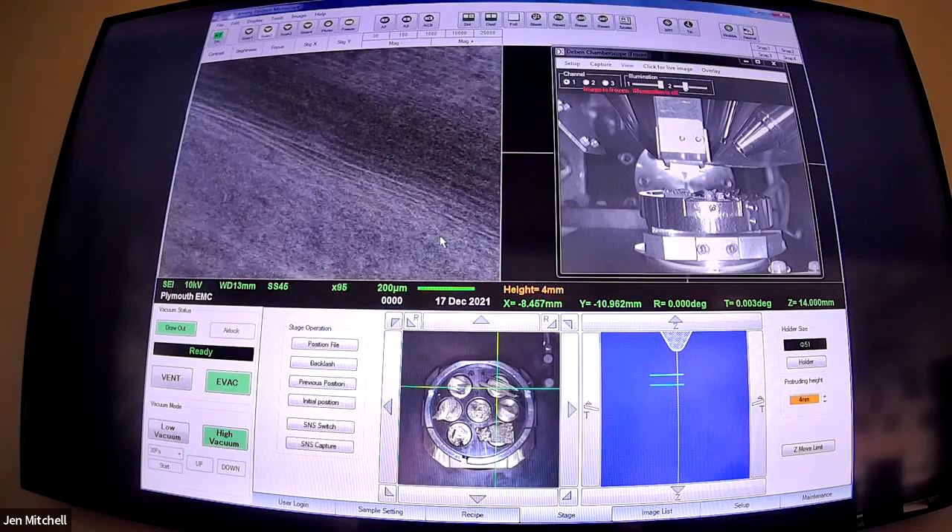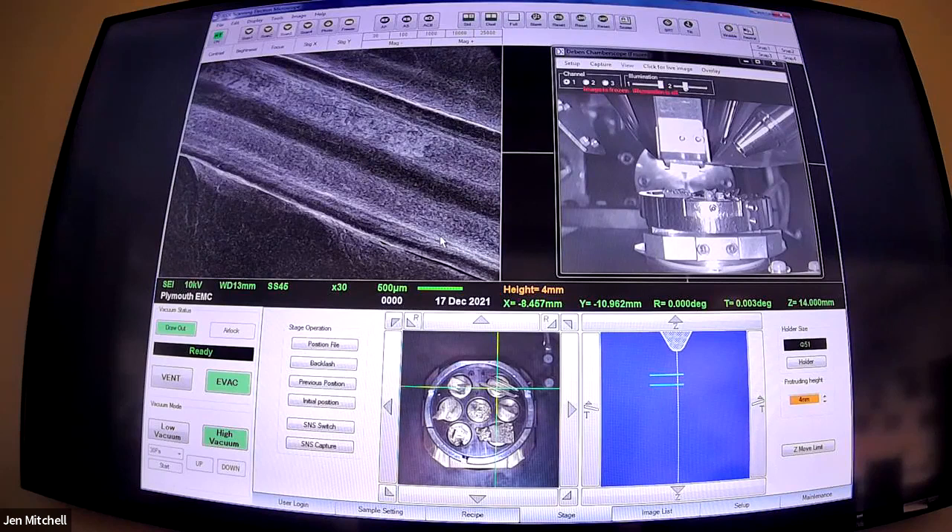Bottom pine leaf - off the bat looks largely the same, but we've got a little bit more texture going on, a little bit more color. We'd expect to see more of those stomata openings as well. We'll take a photo of that.